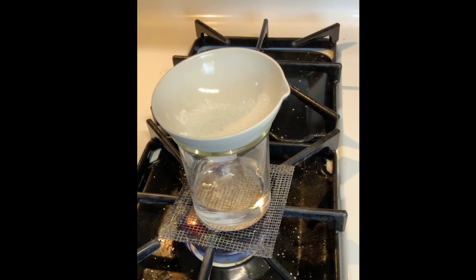After 4 or 5 minutes, and it looks like the residue has no more residual water, go ahead and turn off your stove and allow the evaporating dish to cool. This will take approximately 10 minutes.